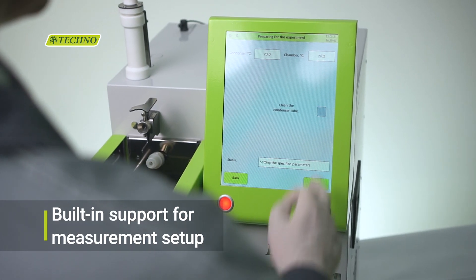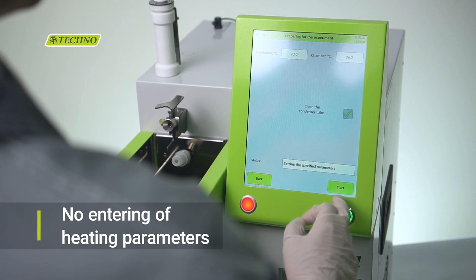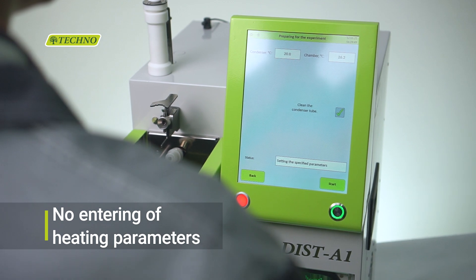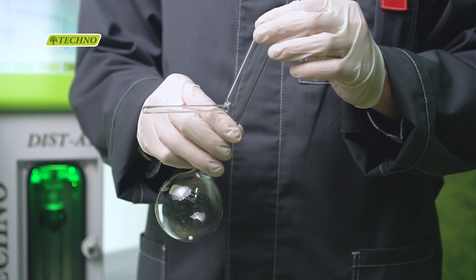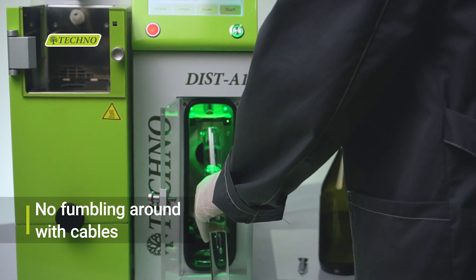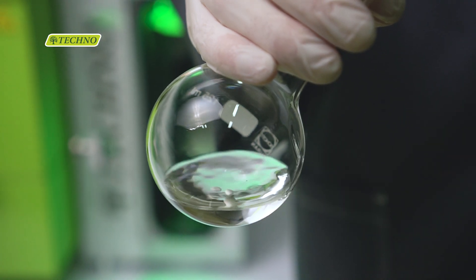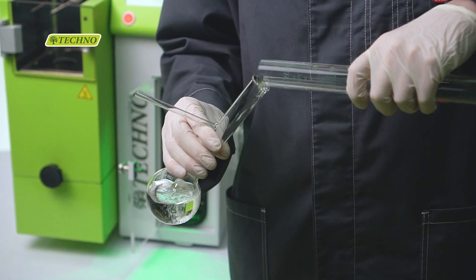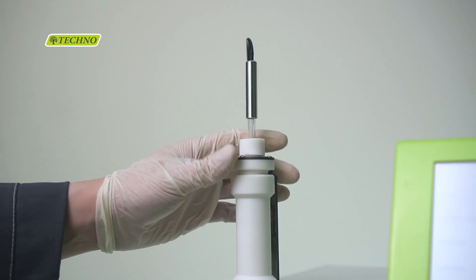Sample volume is automatically adjusted to 100% before analysis. The distillation flask is easily installed in the heating chamber with a specially configured bracket, which also holds the glass PT100 temperature sensor with an integrated chip that holds calibration data.